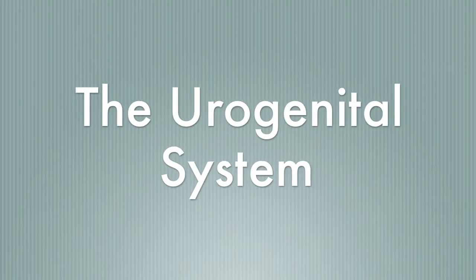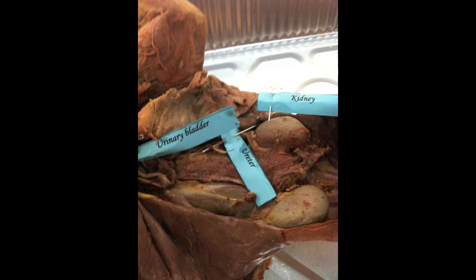The urogenital system. The kidney maintains homeostasis with the regulation of blood pressure by maintaining proper salt and water levels in the blood, regulation of electrolytes, and maintenance of acid-base balance.